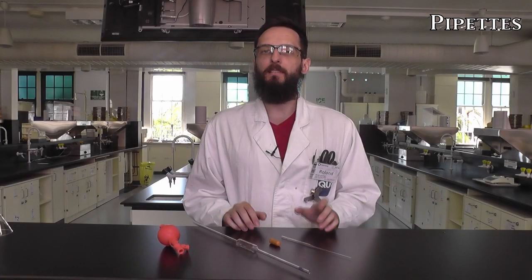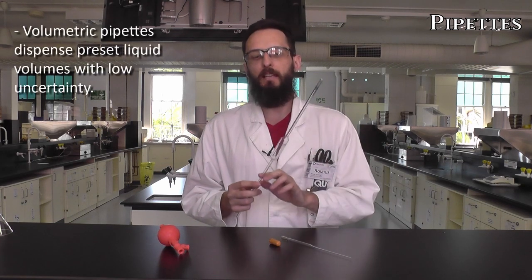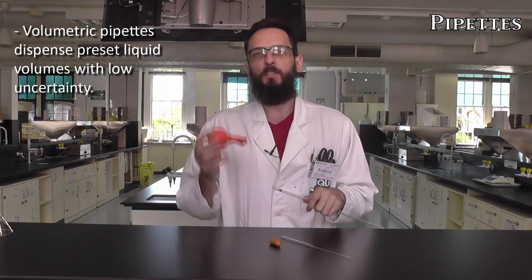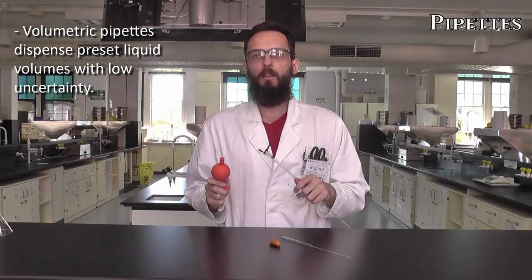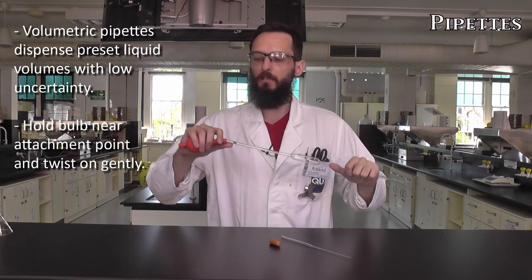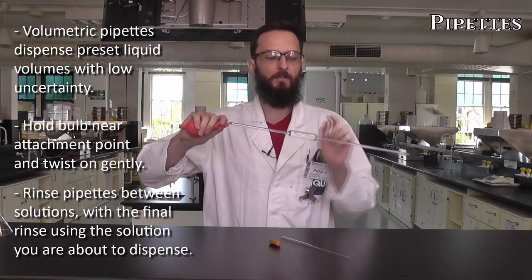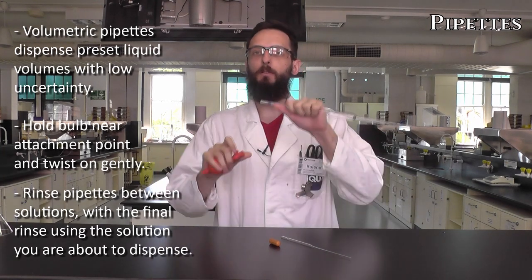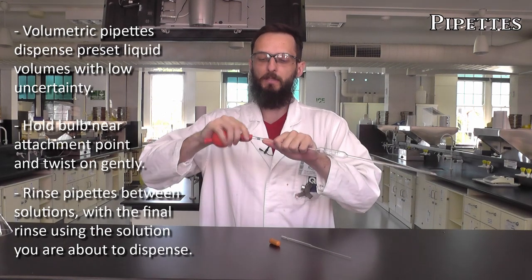When we want to dispense larger volumes of liquid or measure them accurately, we can use these volumetric pipettes, and just like before we fill them up to this mark. They're used in conjunction with these bulbs. When we want to attach these two pieces together, we need to make sure that we don't hold too far down the volumetric pipette, because this places a lot of stress on the glassware joints and it's very easy for it to break. So we want to hold nice and close and just do a gentle twist.